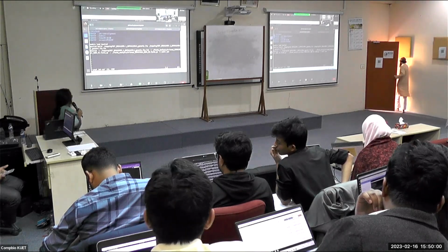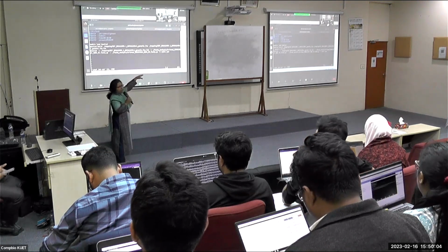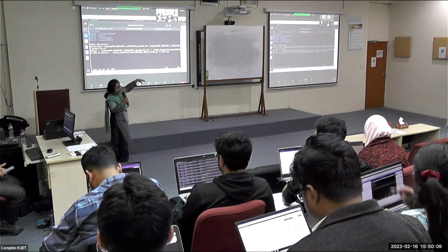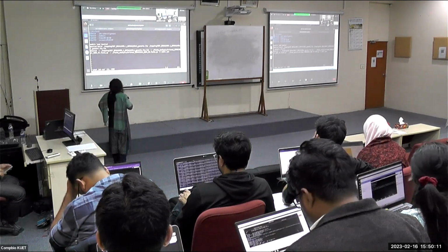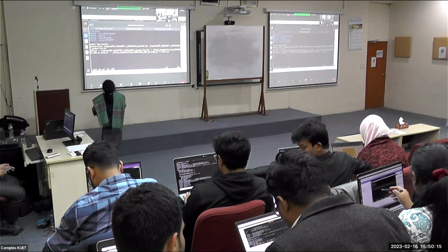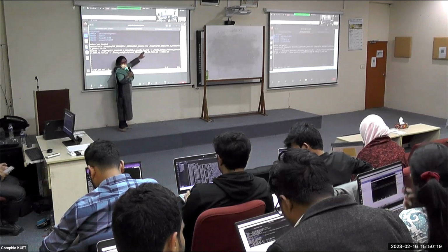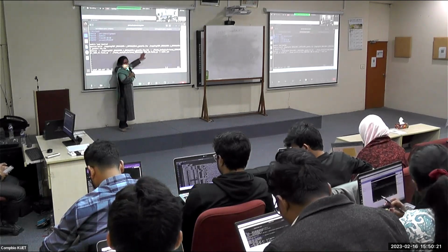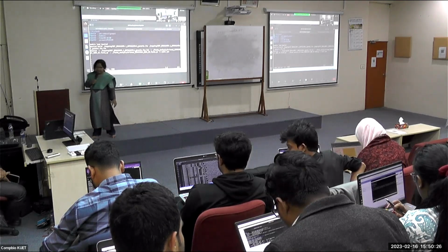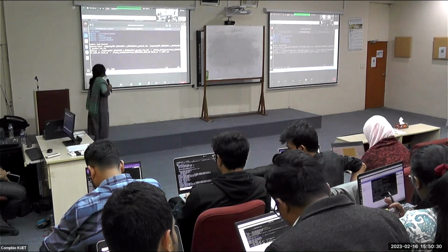So just check whether you have the same folder name or not, because if you do not have the same folder name, then you will not get it correct. Also, you might notice that we wrote only the fna.fai, not the fna. So we are using the index file only for mapping.